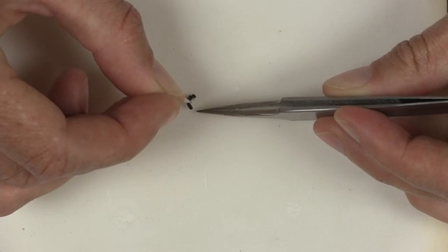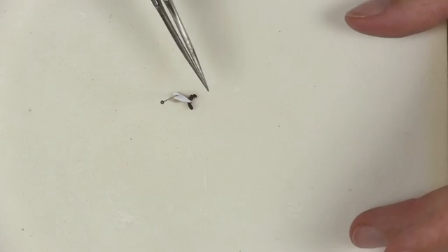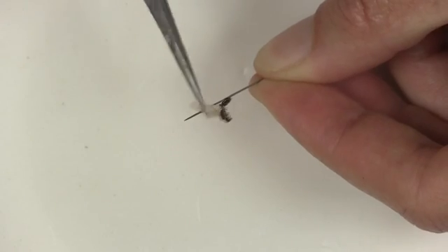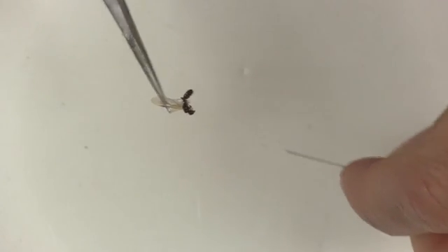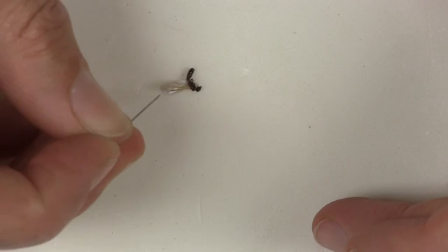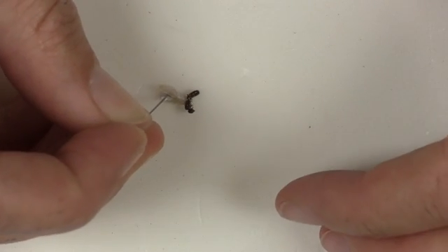Leave the insect stuck this way for 5-10 minutes, or until you are sure that the nail polish is dry. Once it has dried and the insect is firmly stuck to the paper point, use your fine tipped forceps to gently remove the paper point from the insect pin. Re-pin your paper point through the same hole that was previously pinned, but now the insect should be on top and the paper on the bottom.